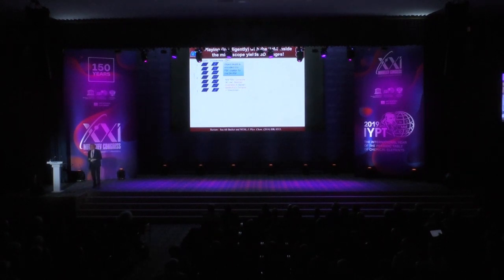We change the microscope by just putting some simple optical components into the microscope. A little glass disc that has some different thicknesses in it. And by some beautiful magic of optics, which actually comes from differential equations and the waves of light and so on, a single emitter becomes 2 spots. And now if I move it up and down in Z, those spots revolve around one another. And that angle between those 2 spots gives me Z information. So this trick takes a conventional microscope and gives you X, Y, and Z.